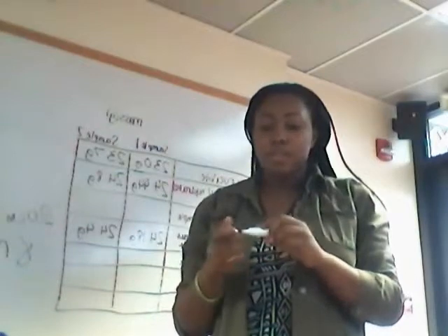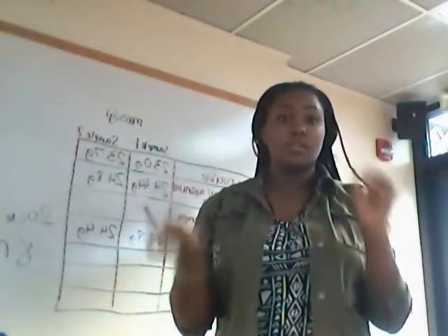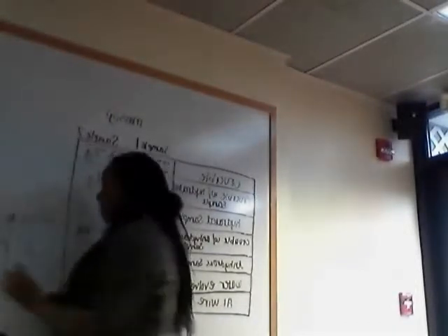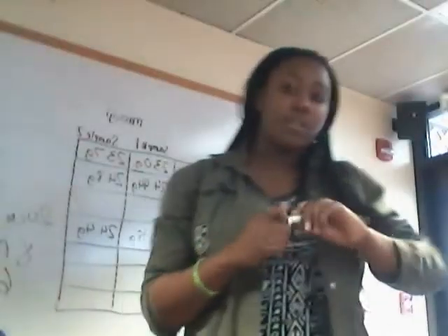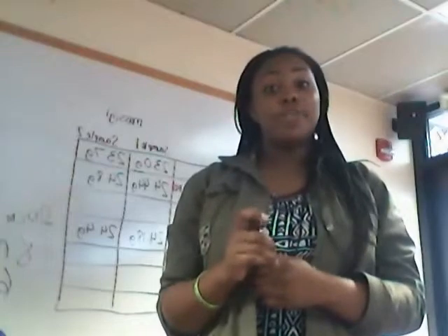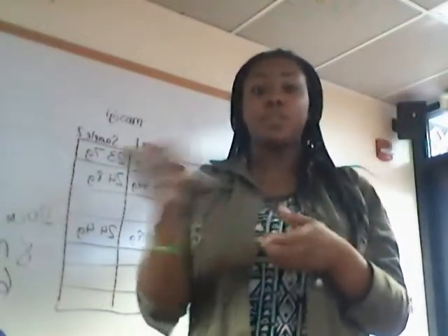After doing that, we found out that the solution was unclear. So we added 6M, which stands for molarity, of HCl. You have to be careful with HCl because it's very reactive. You just want to be careful not to burn yourself. That is why you have to wear your goggles and your apron, and please have gloves. If your teacher doesn't give you gloves, make sure you get them.